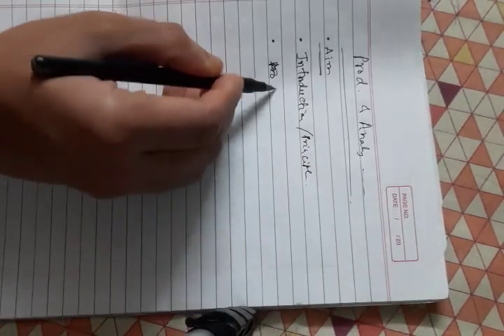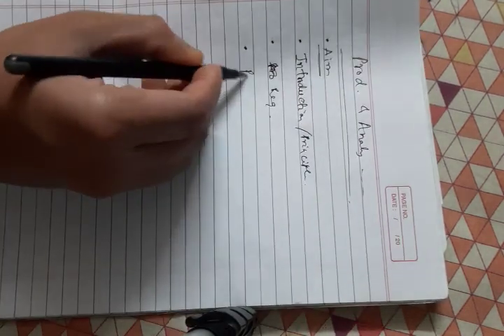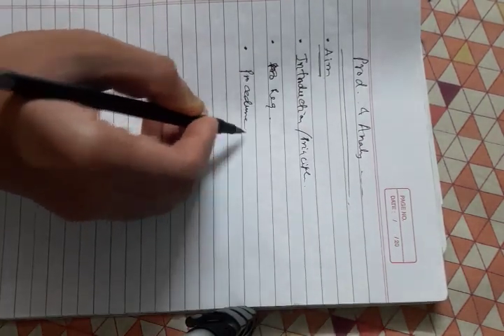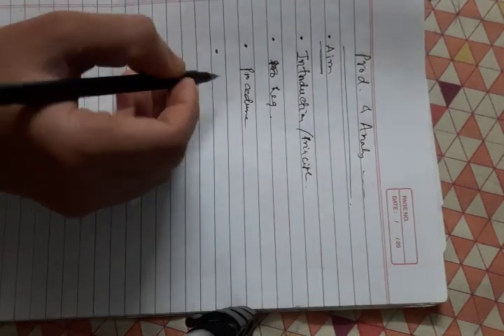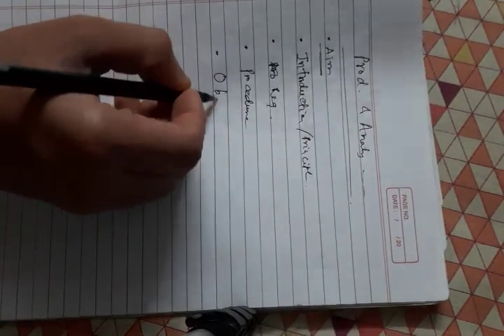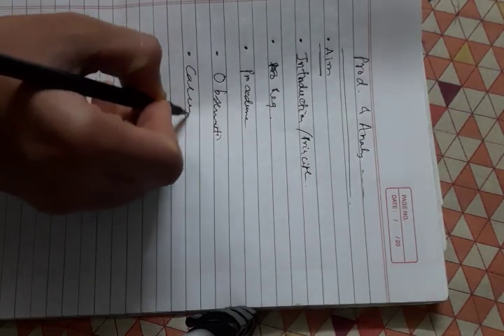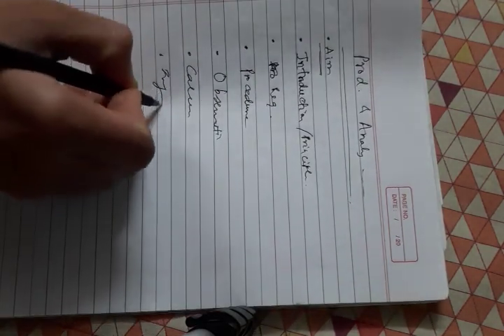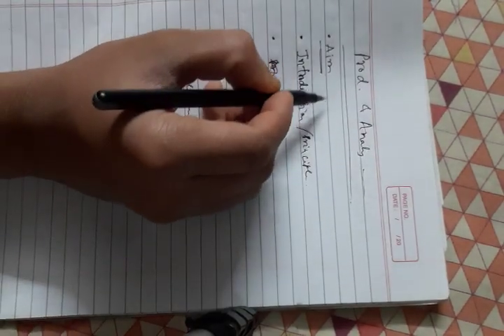Then the requirements, what materials we need, and then the procedure, then the observation, then the calculation, and then the inference. Well, the aim, I already said, is the production and analysis of amylase.